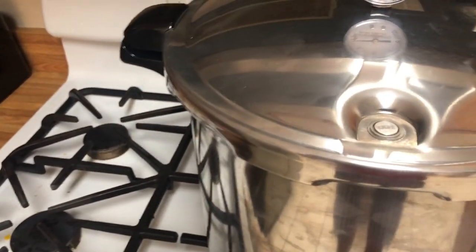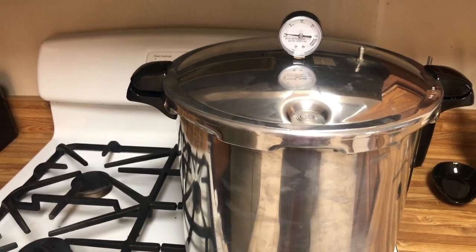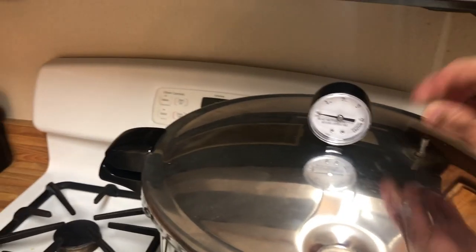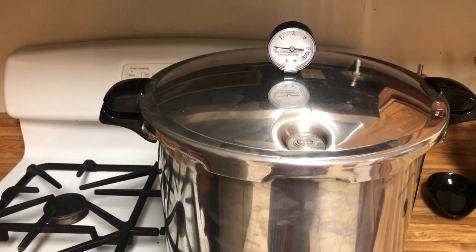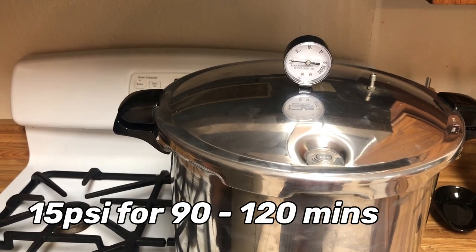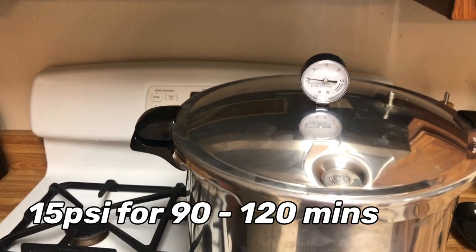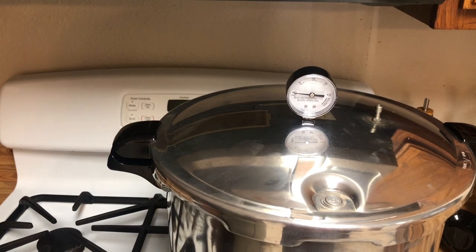Okay, pressure cooker's going, water's heating up. A lot of people let their water boil before they put the lid on. I find it's a waste of time and doesn't really make a difference. So once it starts venting, I let it vent for 10 minutes and then I pop the weight on here to start building pressure. Now you're going to want to pressure cook at 15 psi for 90 to 120 minutes. You can do either. 120 is on the safe side, but I do 90 minutes and it works fine for me. So it's kind of up to you.